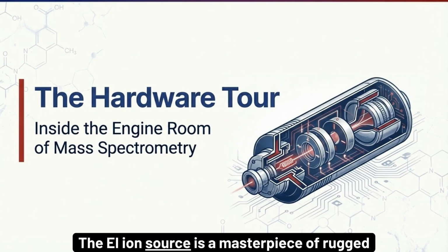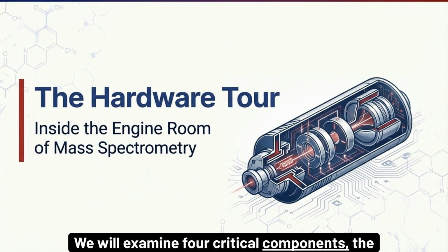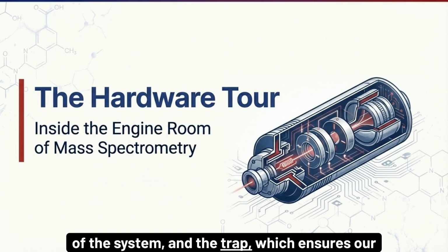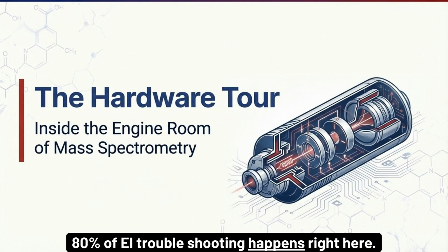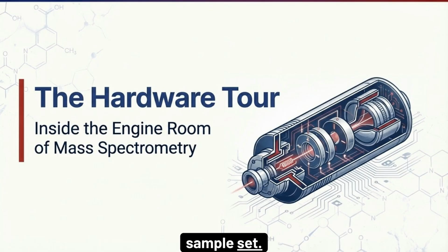The EI ion source is a masterpiece of rugged engineering, built for consistent, high-energy collisions. It is the engine room of your mass spectrometer. We will examine 4 critical components: the filament, the source of our electrons, the electron beam itself, the repeller or the bouncer of the system, and the trap, which ensures our beam stays steady. 80% of EI troubleshooting happens right here. If you understand these components, you can diagnose a failing system before it ruins your sample set.